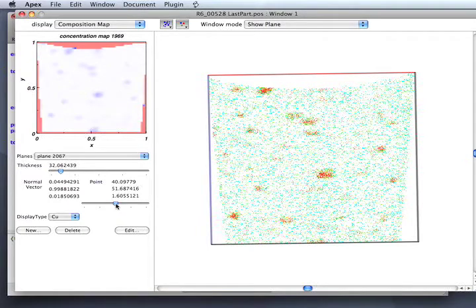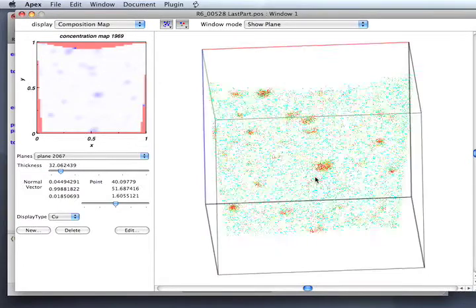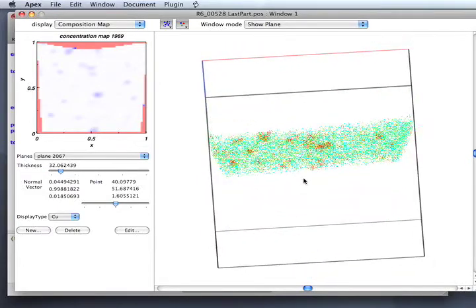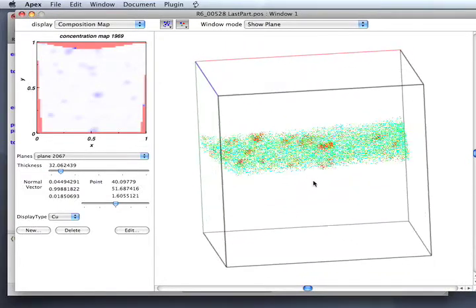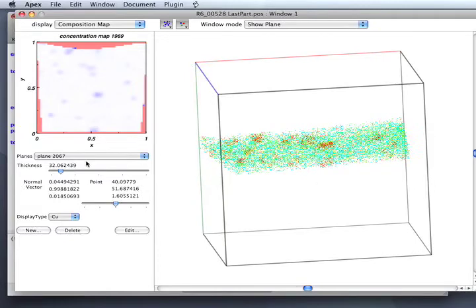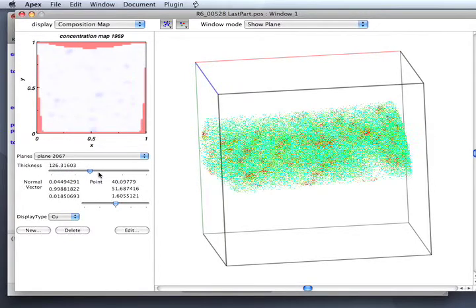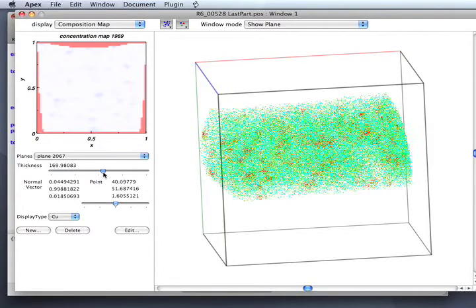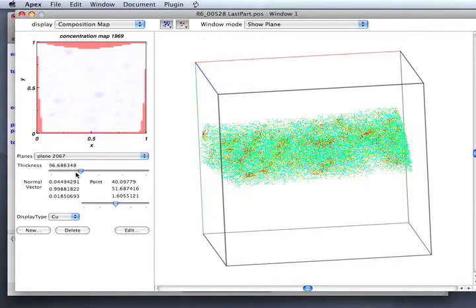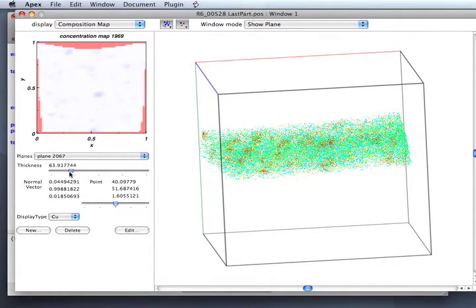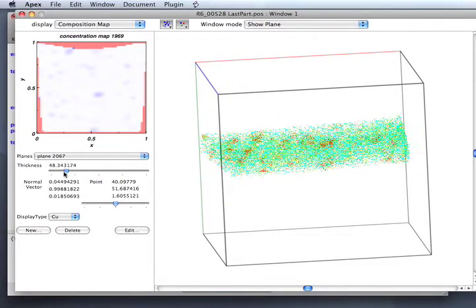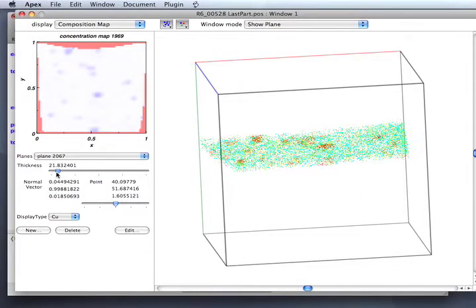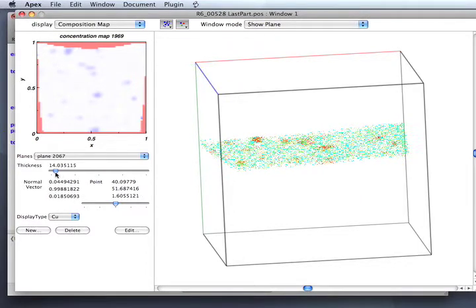The new UI elements—this is a slider which changes the thickness. Let me put the sample on edge so you can see what happens as I make the thickness grow. The plane gets thicker and the contrast in the concentration map goes down because we're sampling above and below the precipitates as well.